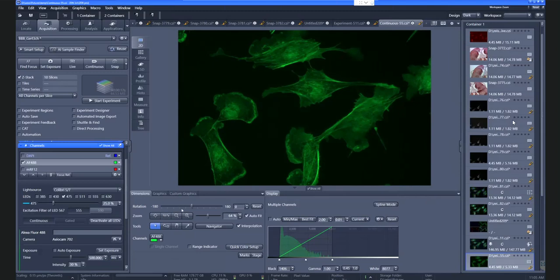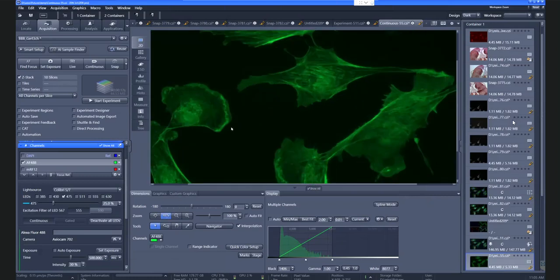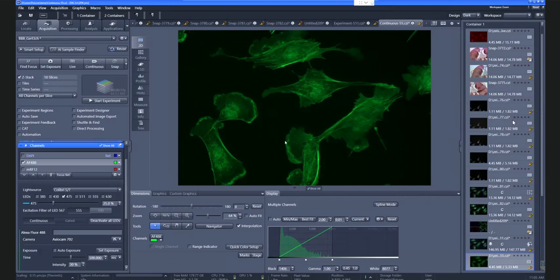If it's about pixel size, I can easily answer this. So it depends on my screen, and I can set it to 100%, which means 1 pixel out of my camera represents 1 pixel on this screen here. And if I have it that way, it's different. Okay, thank you. I think we'll still follow up with the person personally, just to make sure.